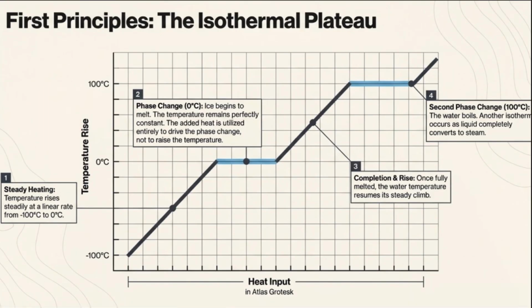However, when the temperature reaches 0 centigrade, the ice begins to melt. Now we are continuously increasing the temperature and putting in heat by the furnace, however the temperature of the system is not increasing. It should increase linearly, but it is not.